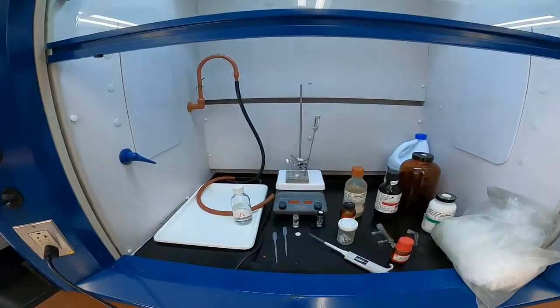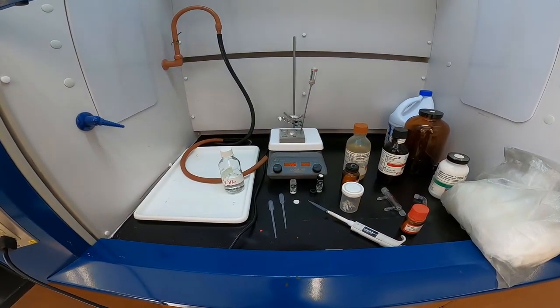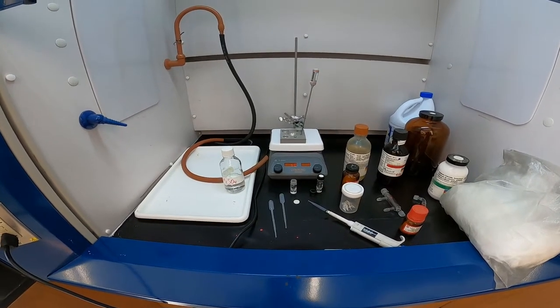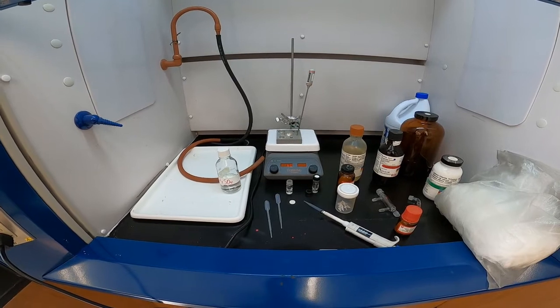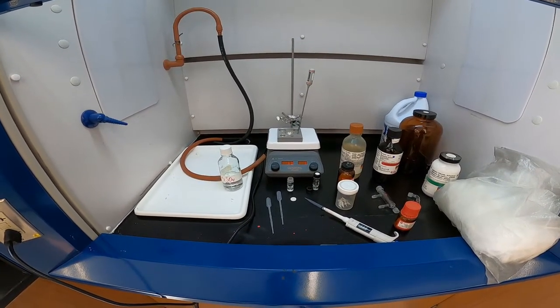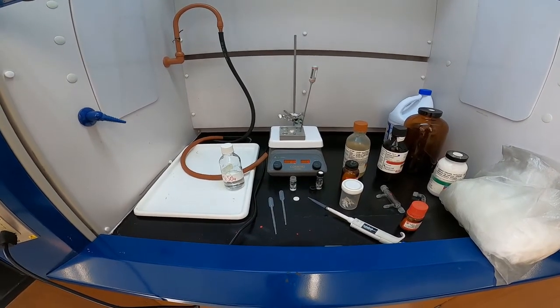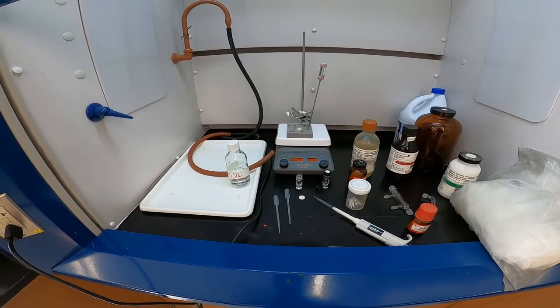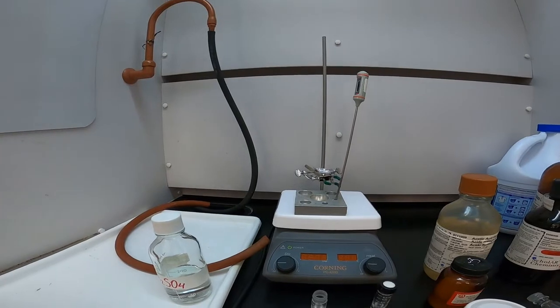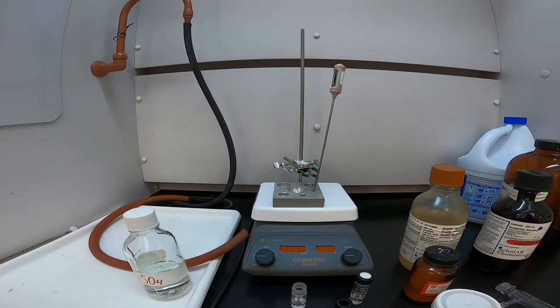So what I have set up here today is the materials we'll need: the chemical, sulfuric acid, glacial acetic acid, isopentyl alcohol, silica gel, calcium chloride, and some glass wool materials to make what's called the calcium chloride drying tube. So the setup I'll explain as we proceed with preparing the reaction.